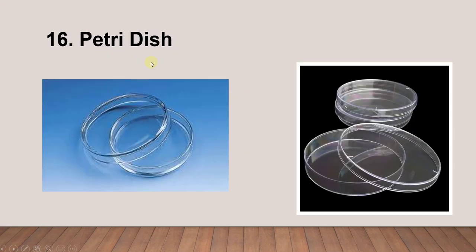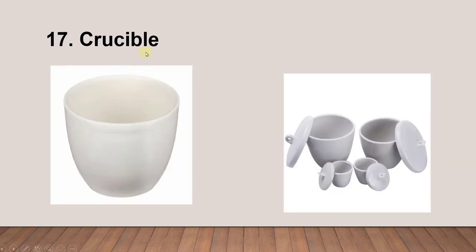Next is the petri dish. We have it made from either glass or plastic. Be careful — never put plastic in the oven. If you want to use it in the oven you have to use a glass petri dish. Next is the crucible, which usually comes with a cover.